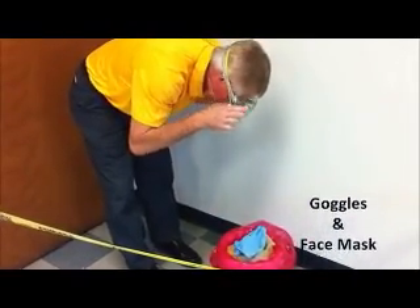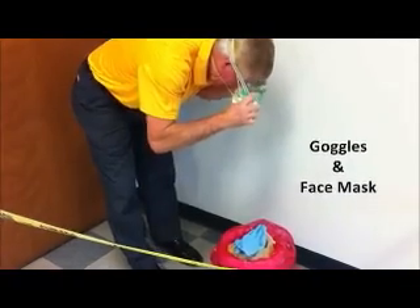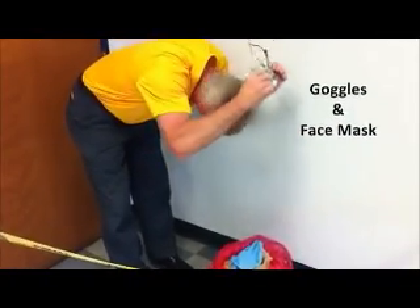With your bare hands, remove your face mask and goggles, placing them into the lined bucket.